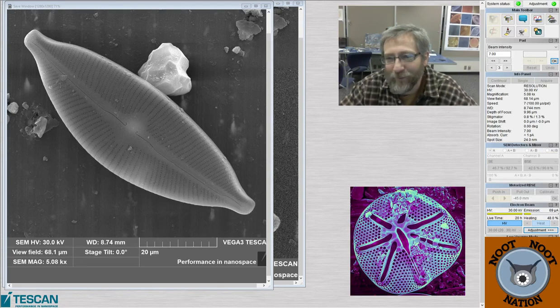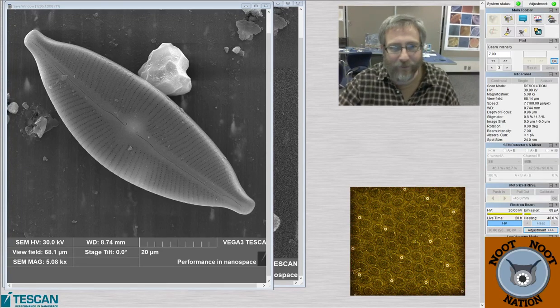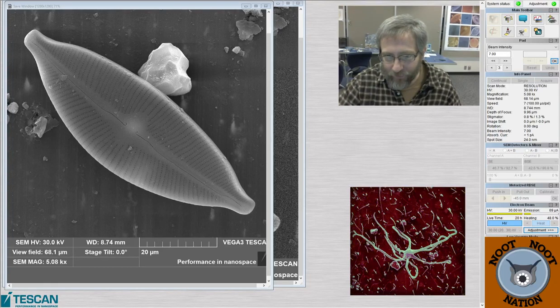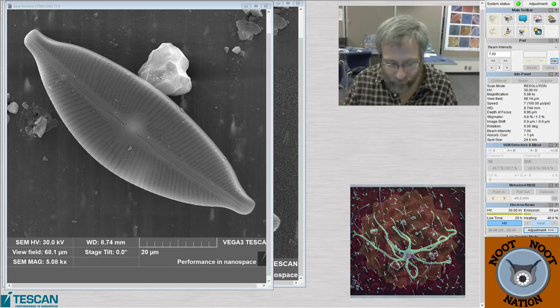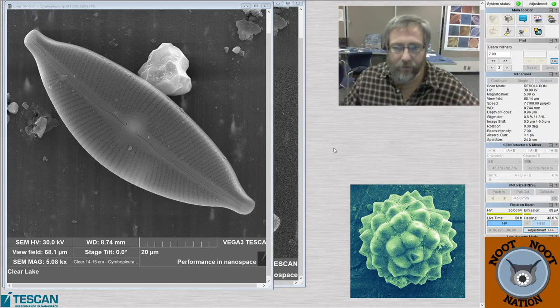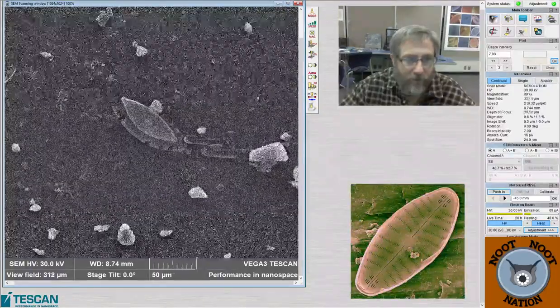The business end of the SEM, expensive to replace. Yeah, it is. Everything in here is expensive to replace. You don't want to have to replace stuff in it. It's cheap to run, believe it or not. The expensive part, if you owned it like we do, is the maintenance person to come and repair stuff or fix things, which is usually a pain in the butt. They're expensive. And if you were using somebody else's, it would be very expensive.